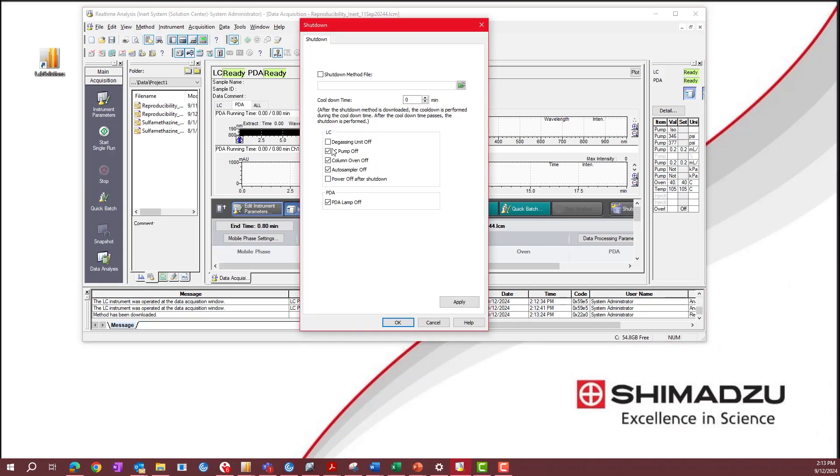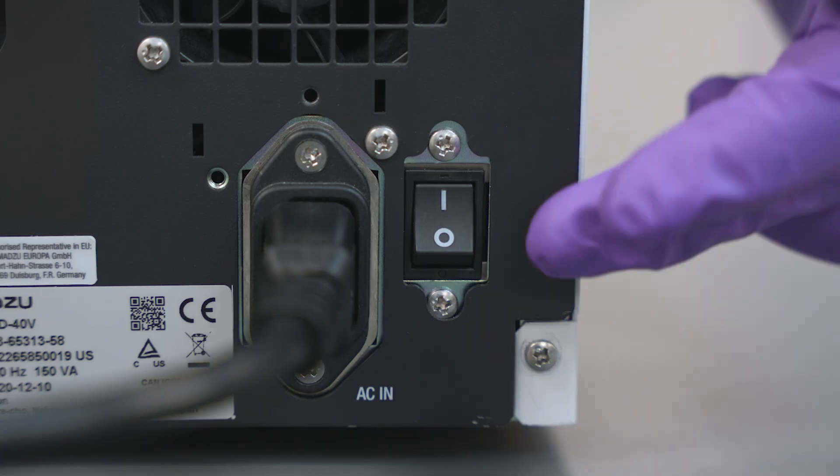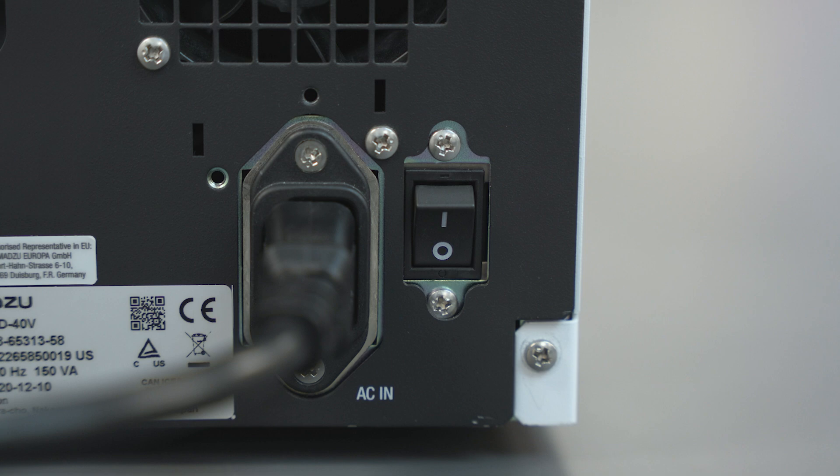Turn the instrument off from lab solutions. Once the instrument is shut down, turn the main power switch located by the power cable at the back of the detector off.